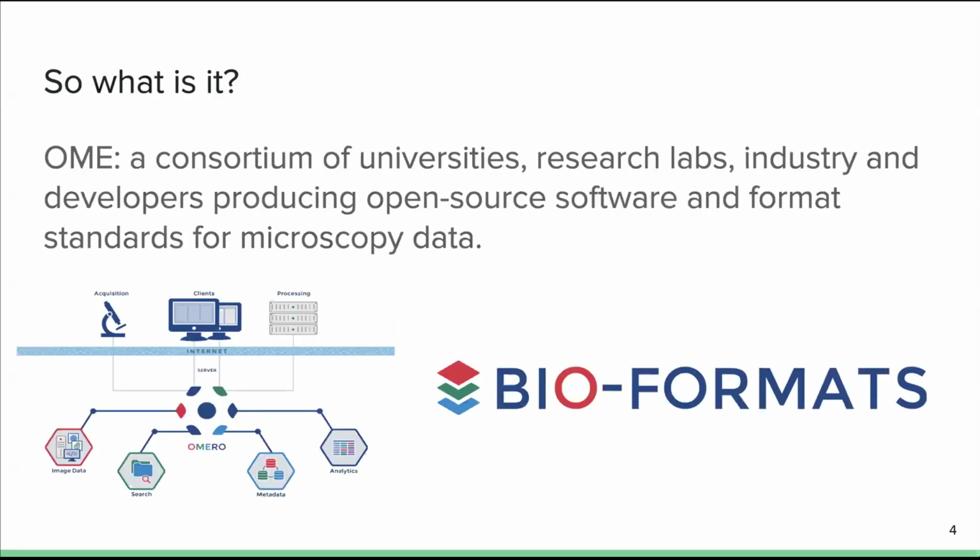So what's OME? OME, the Open Microscopy Environment, represents a community developing open standards and tools for interoperable image data since around 2005. You'll notice a theme here. Some OME tools that you might have come across include OMERO, a web platform for cataloging and accessing bioimages.